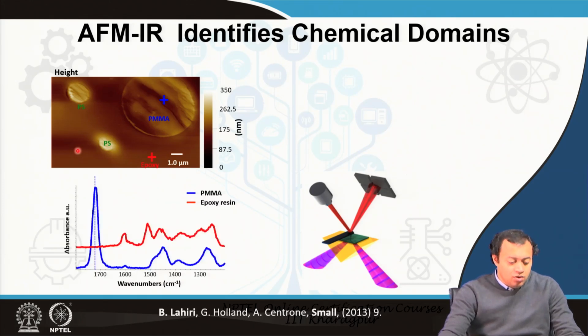Right. Now, we know that polymethyl methacrylate, these big spheres, absorbs a particular frequency. Remember, the absorption peaks are the fingerprint, the signature of each molecule. This is how we identify each molecule. So, PMMA absorbs this, we know from the database, from the library, a known sample. We actually made it like this. This is not naturally occurring, this is artificially made.